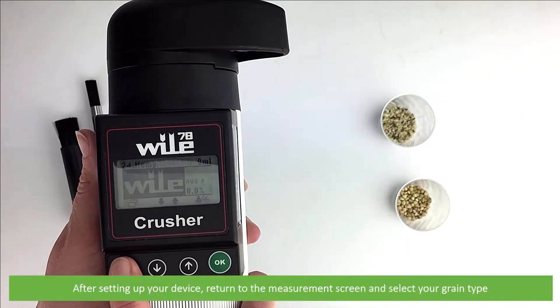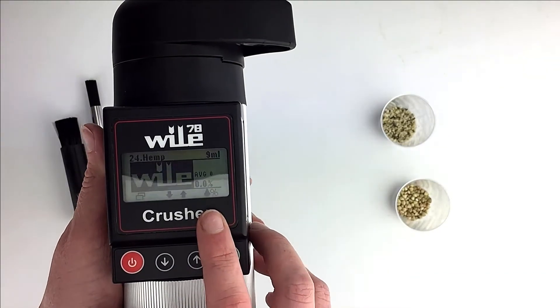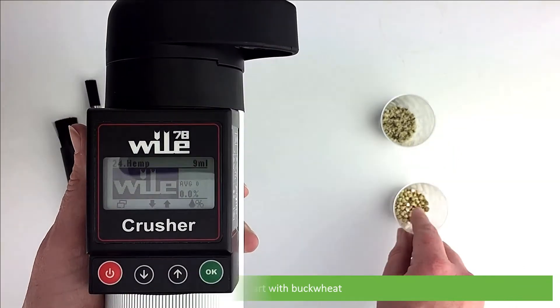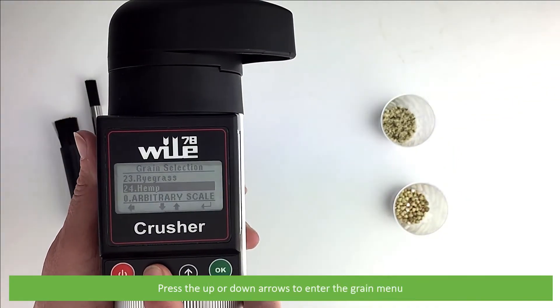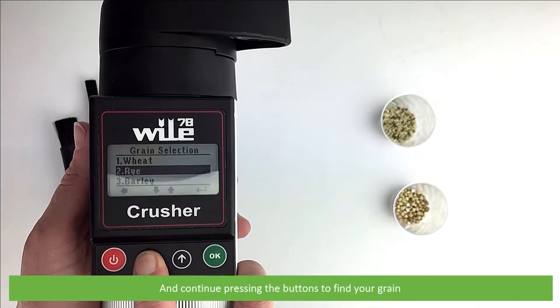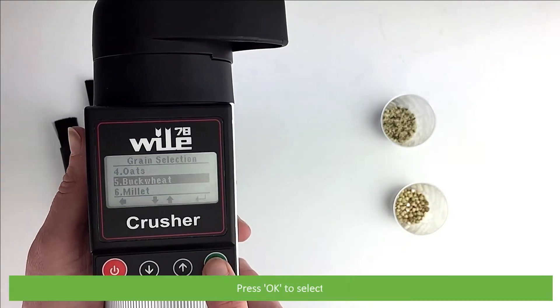After setting up your device, return to the measurement screen and select your grain type. We'll start with buckwheat. Press the up or down arrows to enter the grain menu and continue pressing the buttons until you find your grain. Press OK to select.